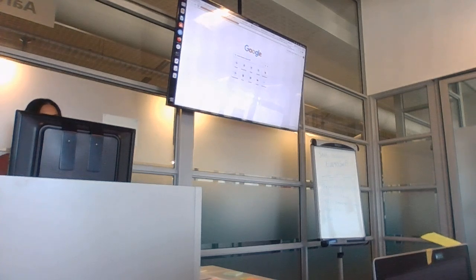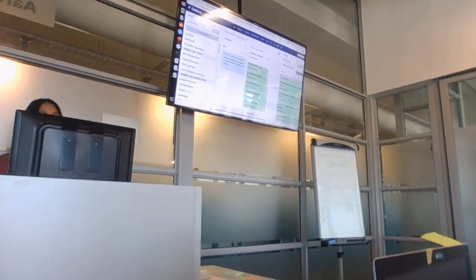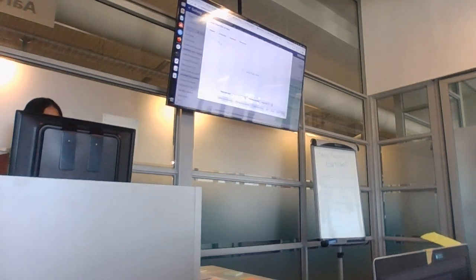It is downloaded already. If it's downloaded already, make sure that you're in the cholera data set, because I want to show you something. Make sure you're in this one. So if you were here, you can click on switch to. Here by me it says this now. Let me just show you. But you have to click on here to switch to, and it will switch to the right history. You can close this. Switch, and then you're going to upload that file that you just downloaded.